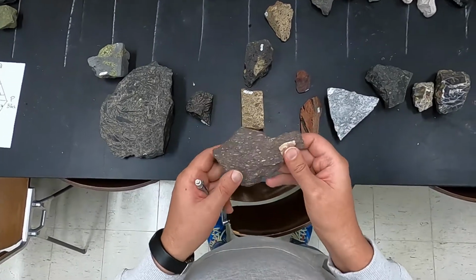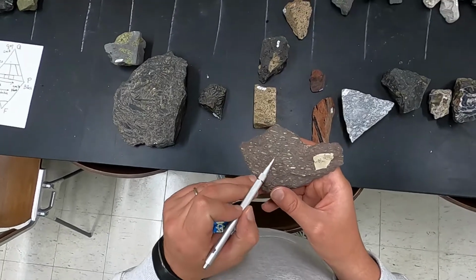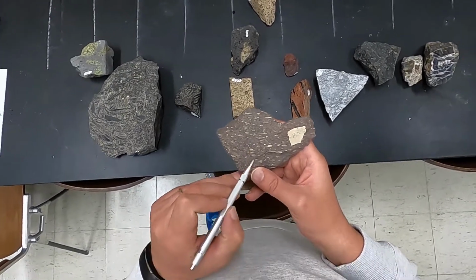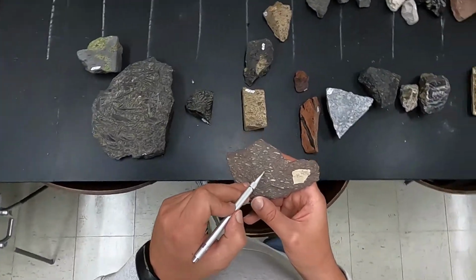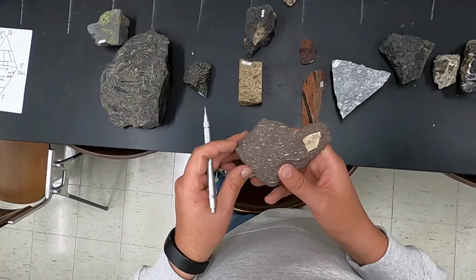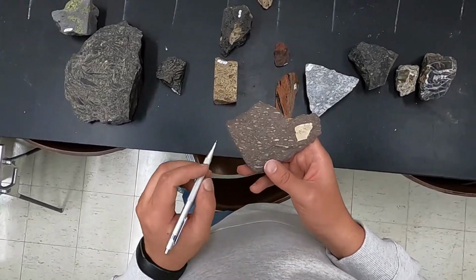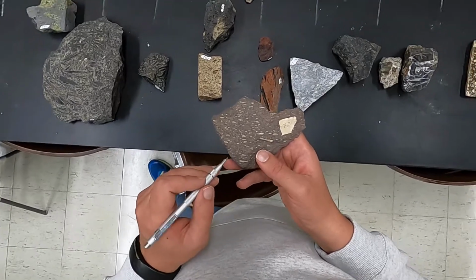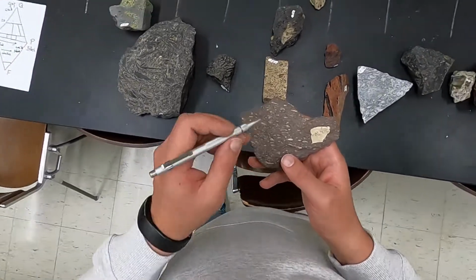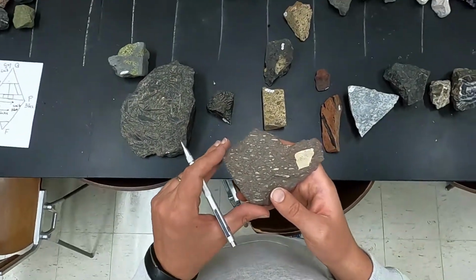But another feature that is remarkable here is the fact that these are forming amygdales. So the bubbles have been stretched, so I have a flow structure which is indicative of a lava, and at the same time I have a situation in which the cement is infilling the amygdales.